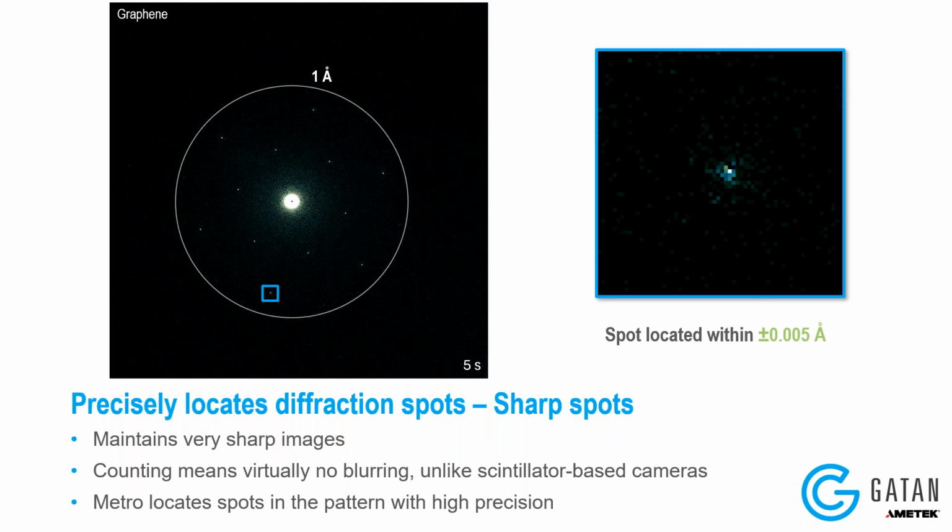And in many cases, you can actually see some details of the sample itself, maybe of the geometry of the sample from these diffraction spots that will actually have some structure within them. This one is mostly just a single pixel, but with the very sharp patterns that are produced by the camera, you can start to see interesting detail within single diffraction spots.